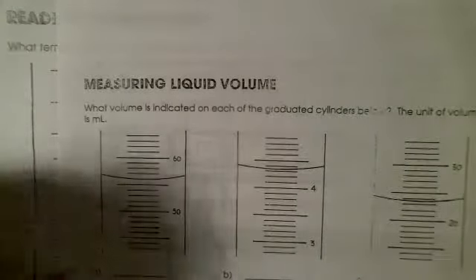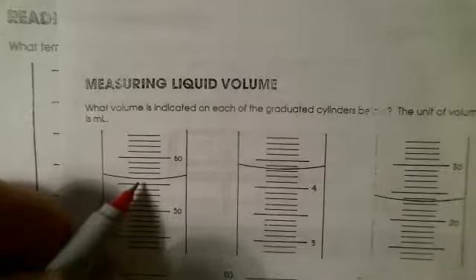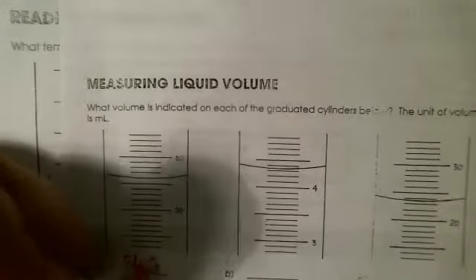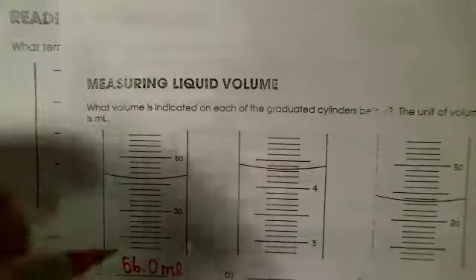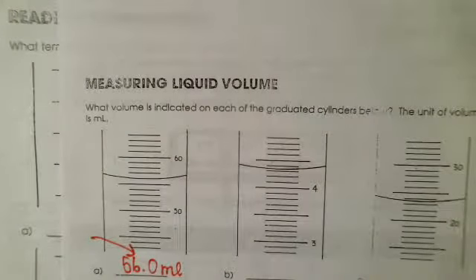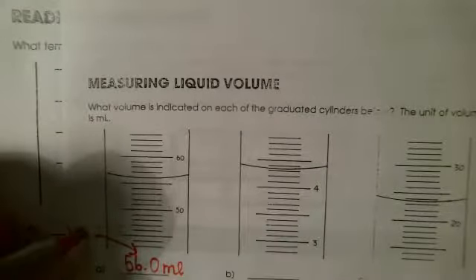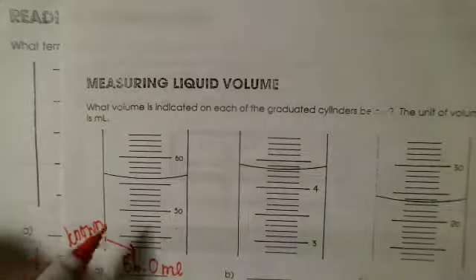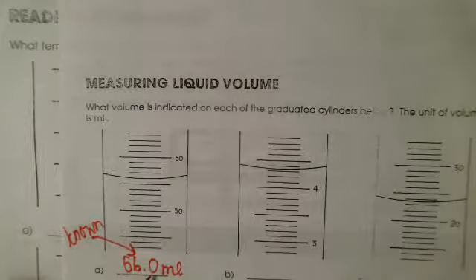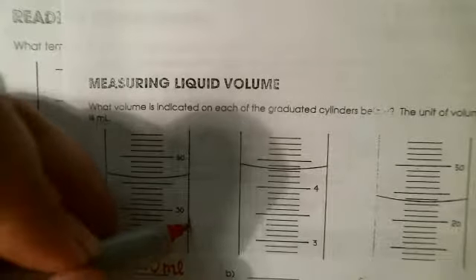So in this case, since the meniscus is right on that 56 milliliter line, it'll be 56.0 milliliters. This 6, that's the units place. We know that for a fact. So this is known based on the equipment we are using because we can see the actual line. Then we have to estimate one more spot. So this is the one we estimate.